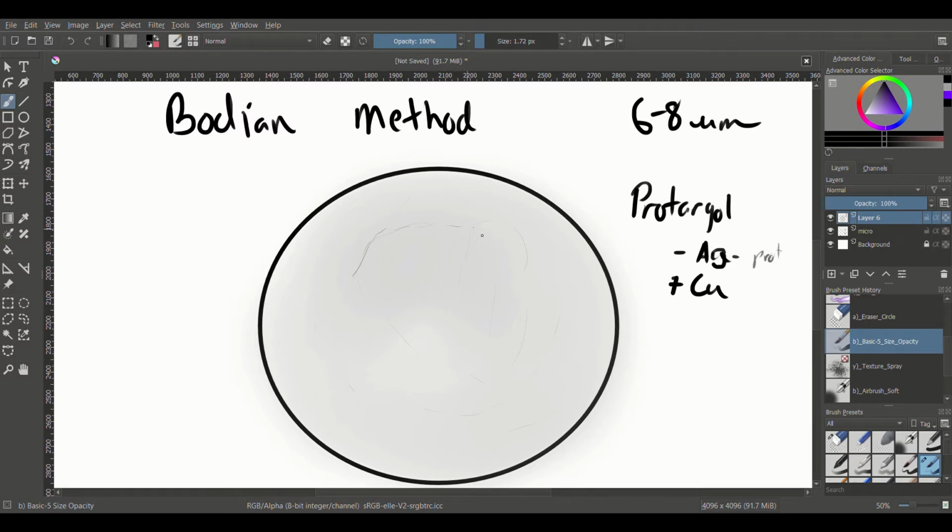But remember, when it deposits, it's still not all that visible. It can be kind of an orangish color sometimes, or brown, and it doesn't have a ton of contrast. But you might see some neurofibers start to show up. So at this point, at the reduction, it's there, but we haven't toned it yet. So we just have some squiggles, and they're not going to have a ton of contrast when we add a counterstain to it.